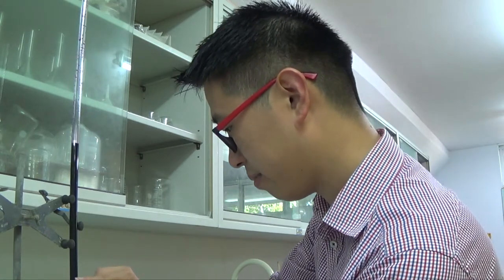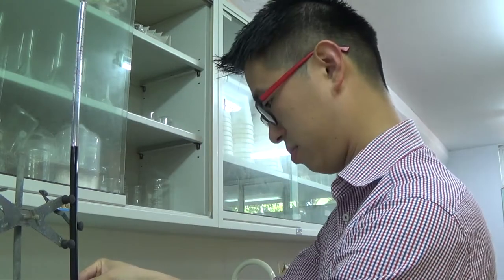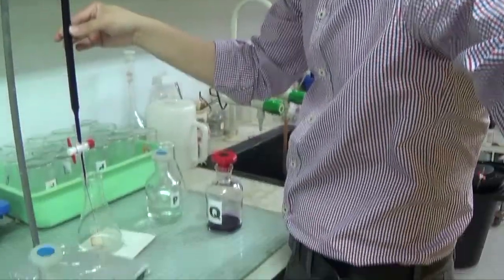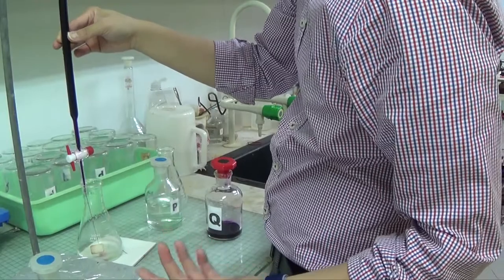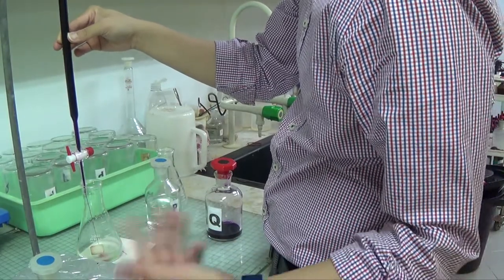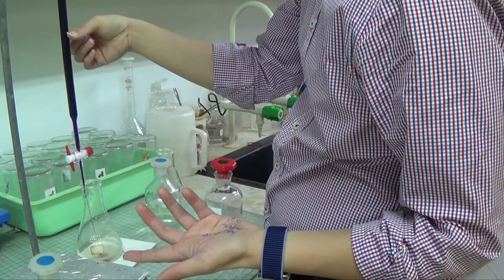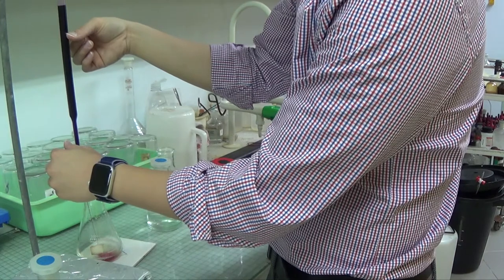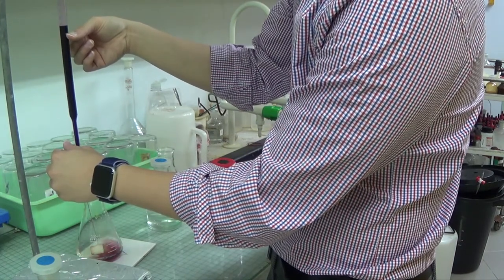So there's around there. I do not want to overshoot, so 42.40. I do not need to worry about doing it drop by drop at the beginning, because it's never going to change, because we know the endpoint roughly already, right? And we know the exact endpoint from our first exact titration. Now I'm just doing a second exact titration just to confirm, was I wrong or would I get within plus or minus 0.10? That is the whole point of doing a second titration.